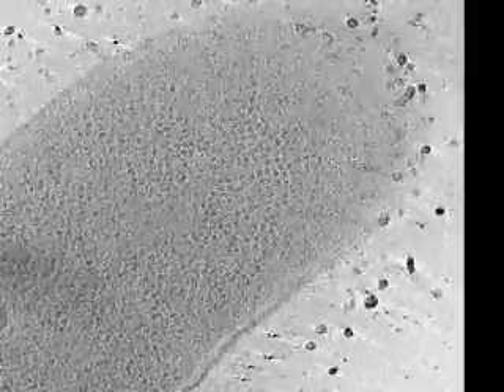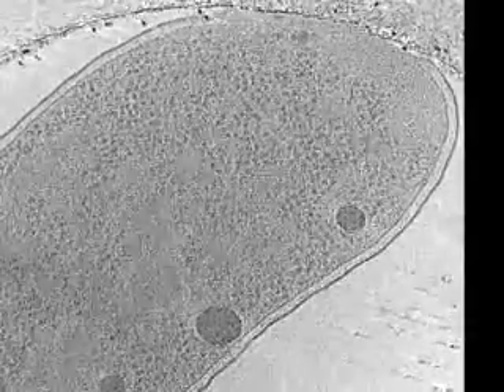We observed up to 5 type 6 secretion structures per cell. In order to obtain higher resolution views of the structures, we also imaged the cells in a cryoelectron microscope. This is a 3D cryo-tomographic reconstruction of a single cell shown slice by slice.